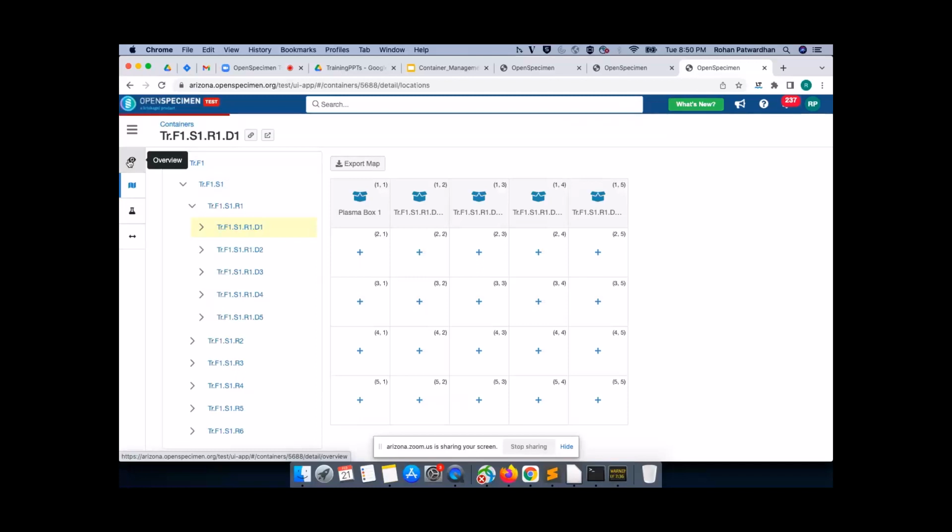Yes. So basically anything that can be stored in a freezer has to be ideally mapped as a two-dimensional entity, so that it can be created within the system. Okay. Basically what we are trying to do over here is mimic how it looks visually in your system, rather than making it technically correct that it is a three-dimensional view. We are not trying to mimic the three-dimensional view. Good. Thank you. Yeah.